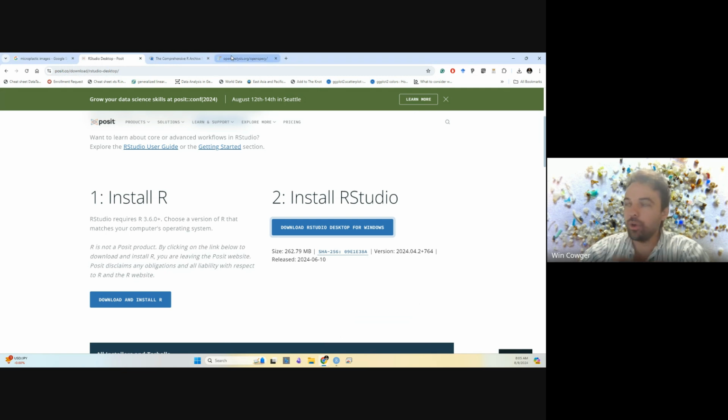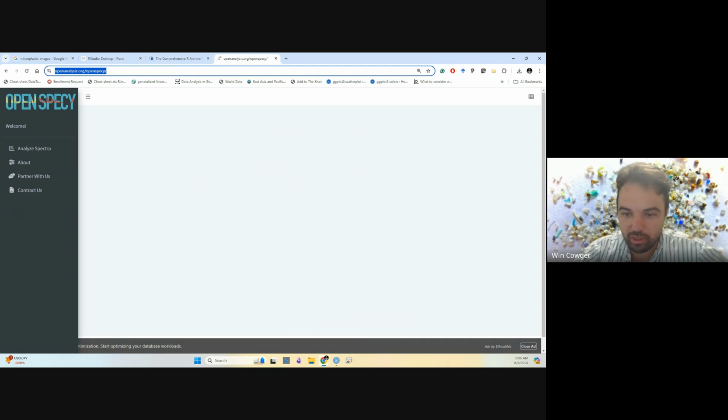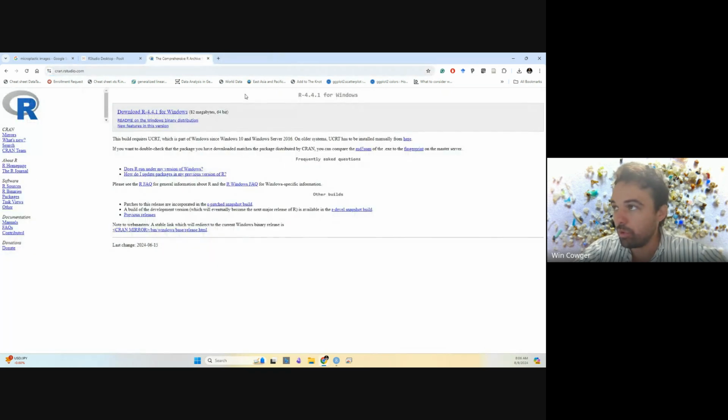And don't worry if getting R installed becomes a problem for you. You can use the Open Specy website, the web tool, for this tutorial today.